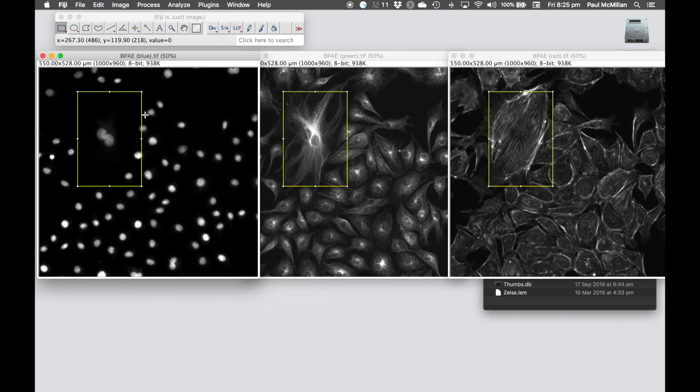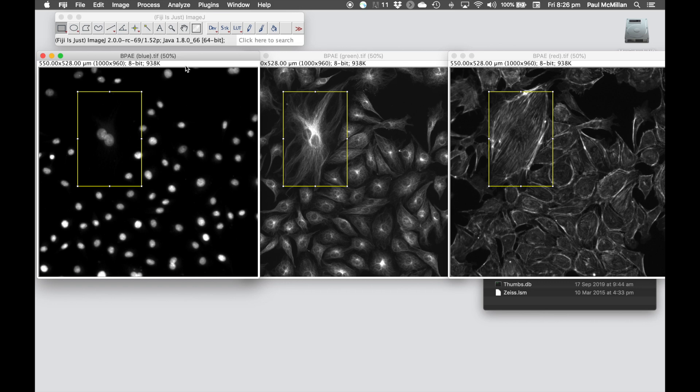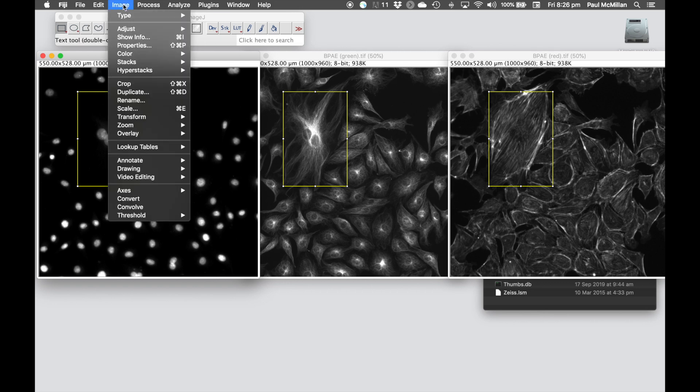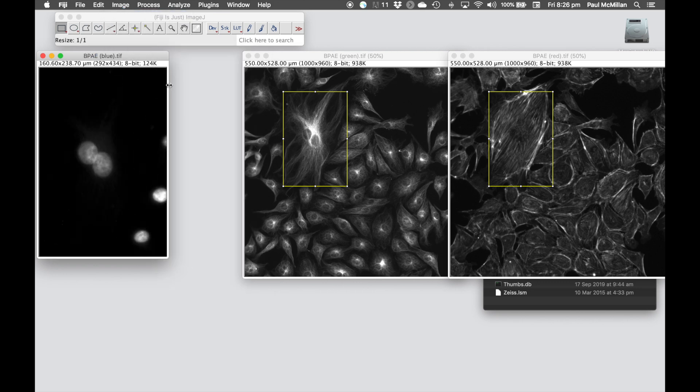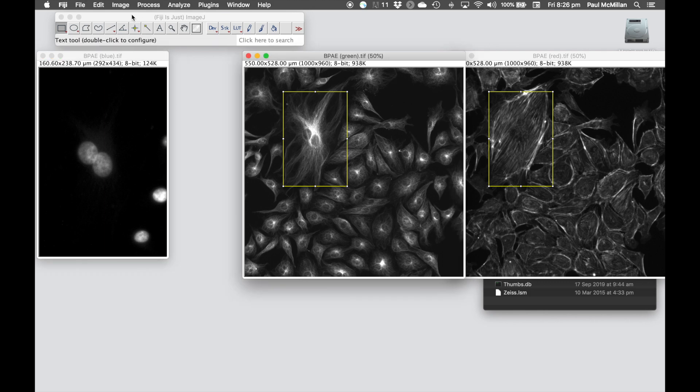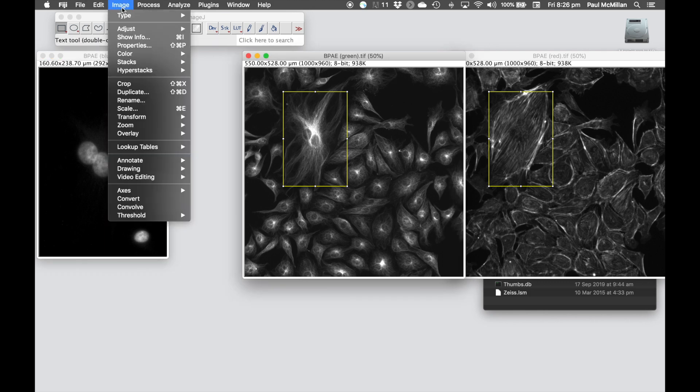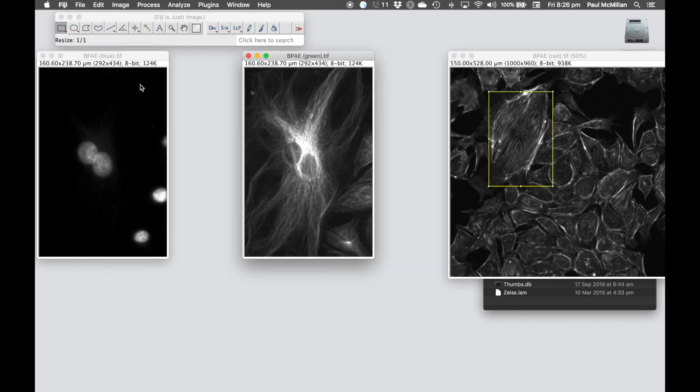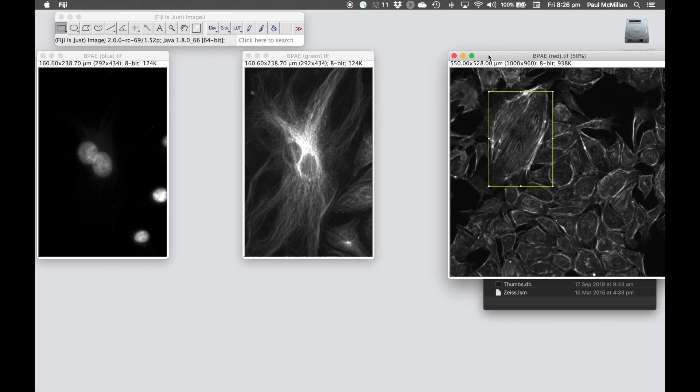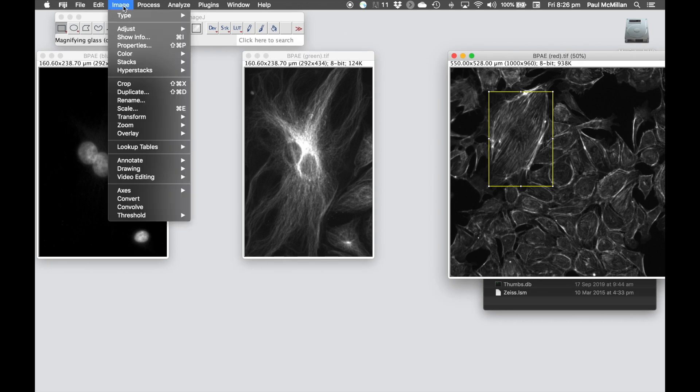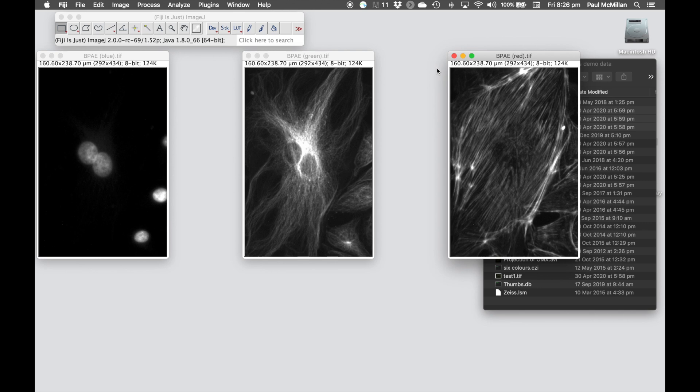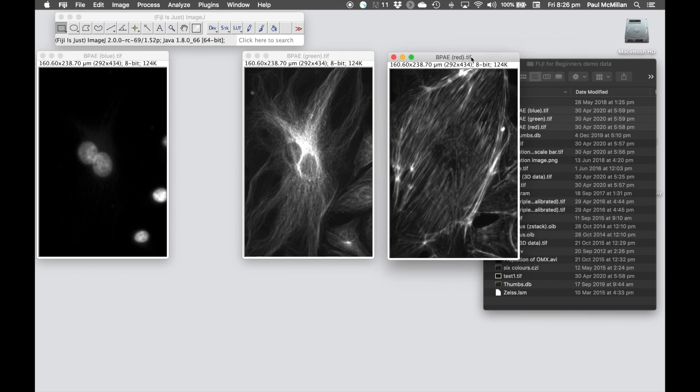Next step then is if we want to crop down to this region of interest, we're going to use the crop tool, which is under Image, Crop, or Control-Shift-X, and again we can do that for each of the channels, and now we've selected what we're going to use to make our figure panel.